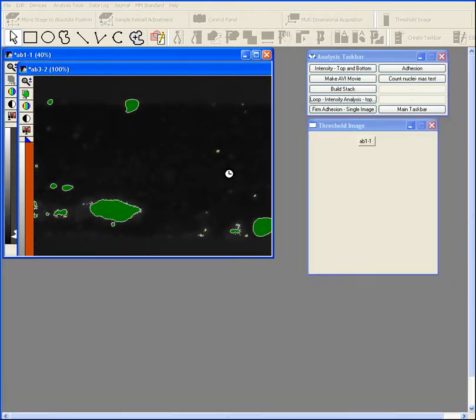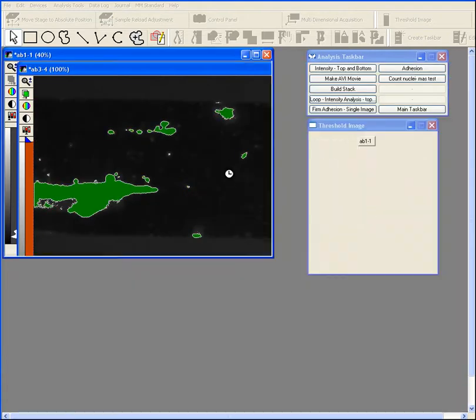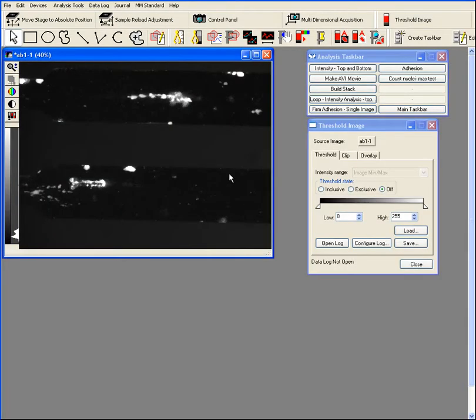So it's going to cycle through each image and in each case it's logging all of the data to a text file.